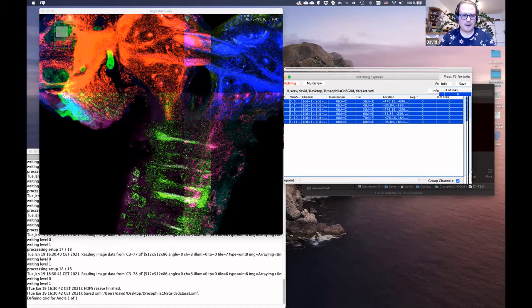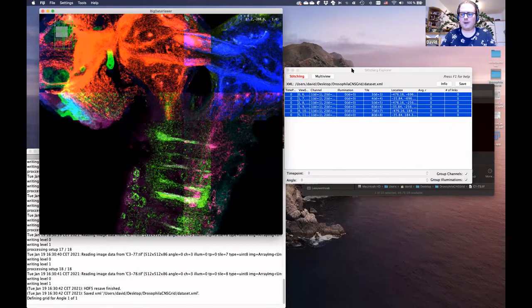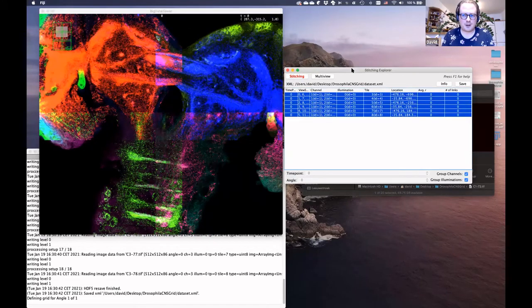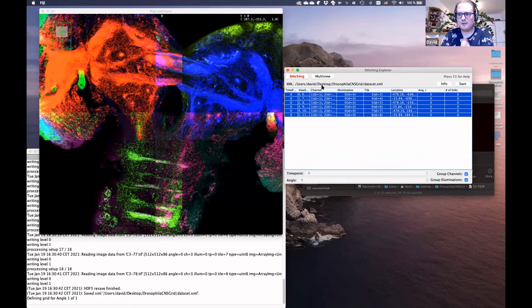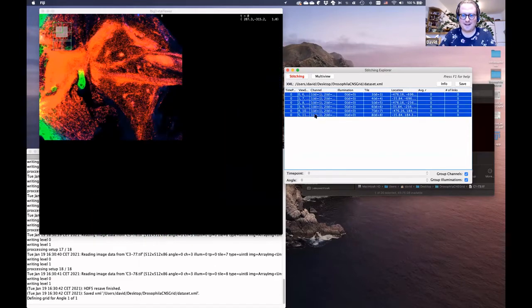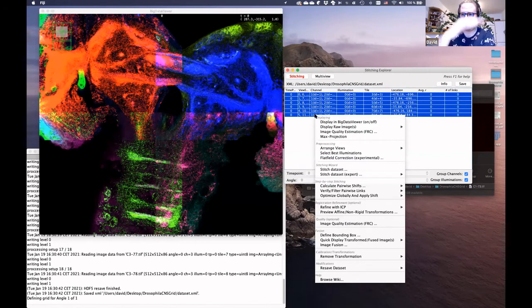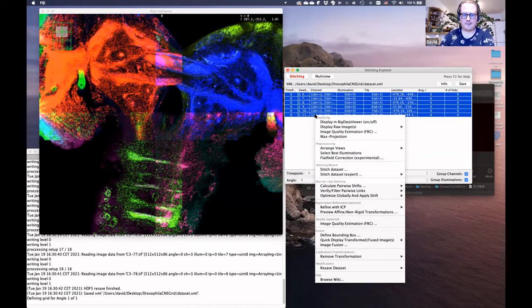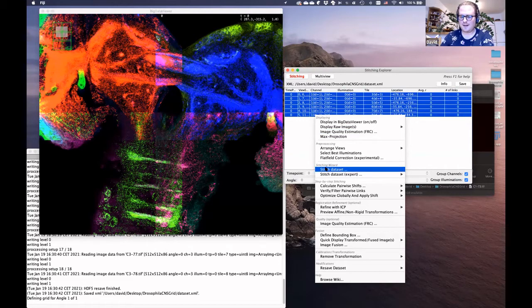In the main window there is a list of all the images in your dataset. You can look at them individually or select multiple. By default we group the color channels, but you can unclick this to look at only the red channel. A useful feature is that if you click into this window and press the C button, it will color the different tiles in your dataset differently, so you immediately see if there are any errors in the alignment of the tiles.